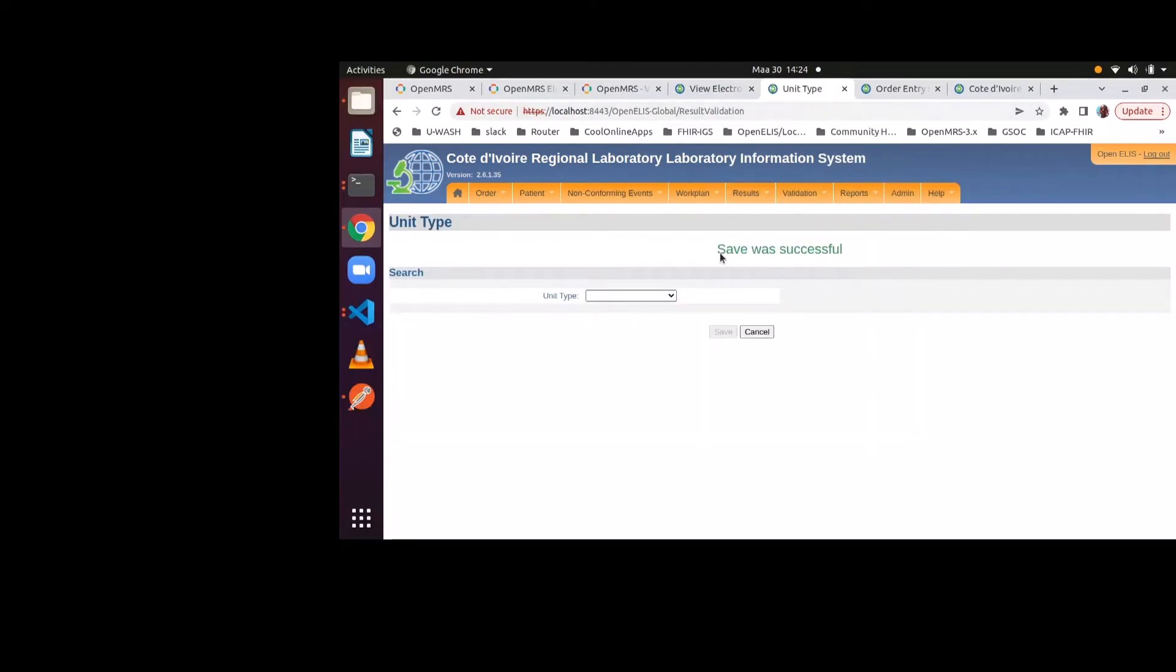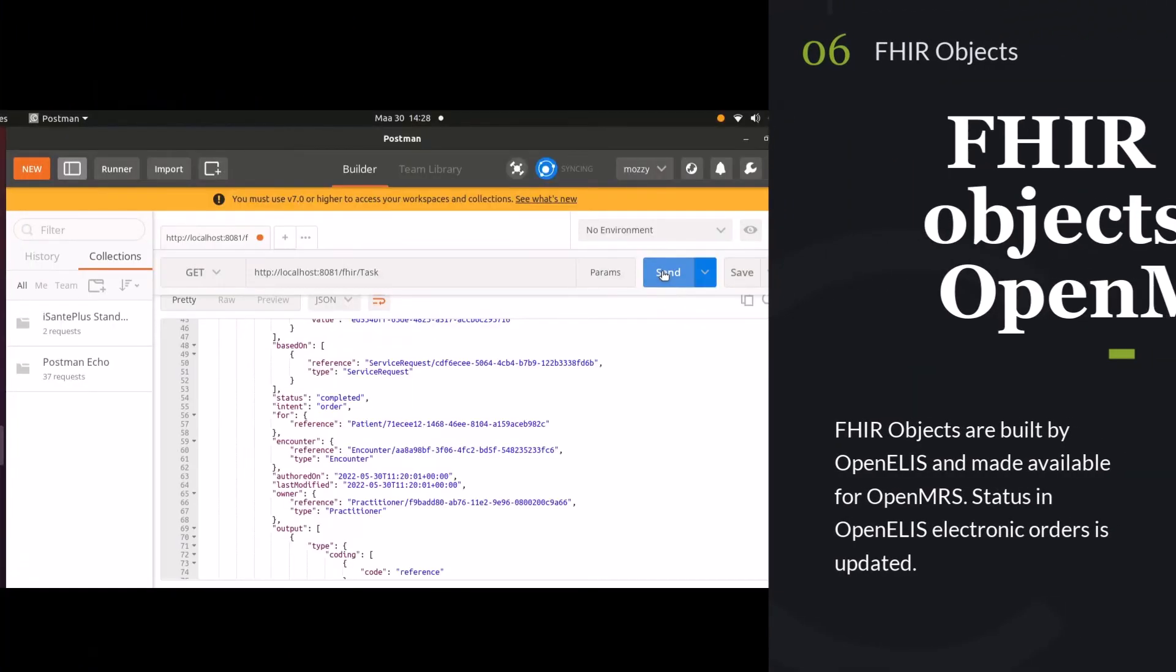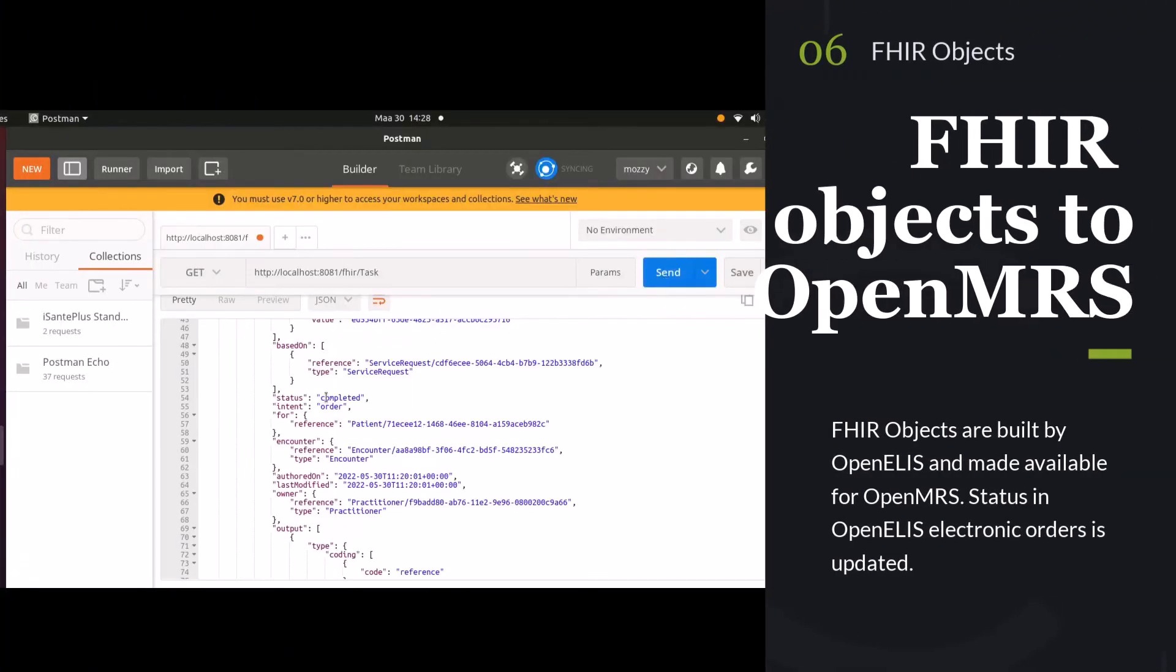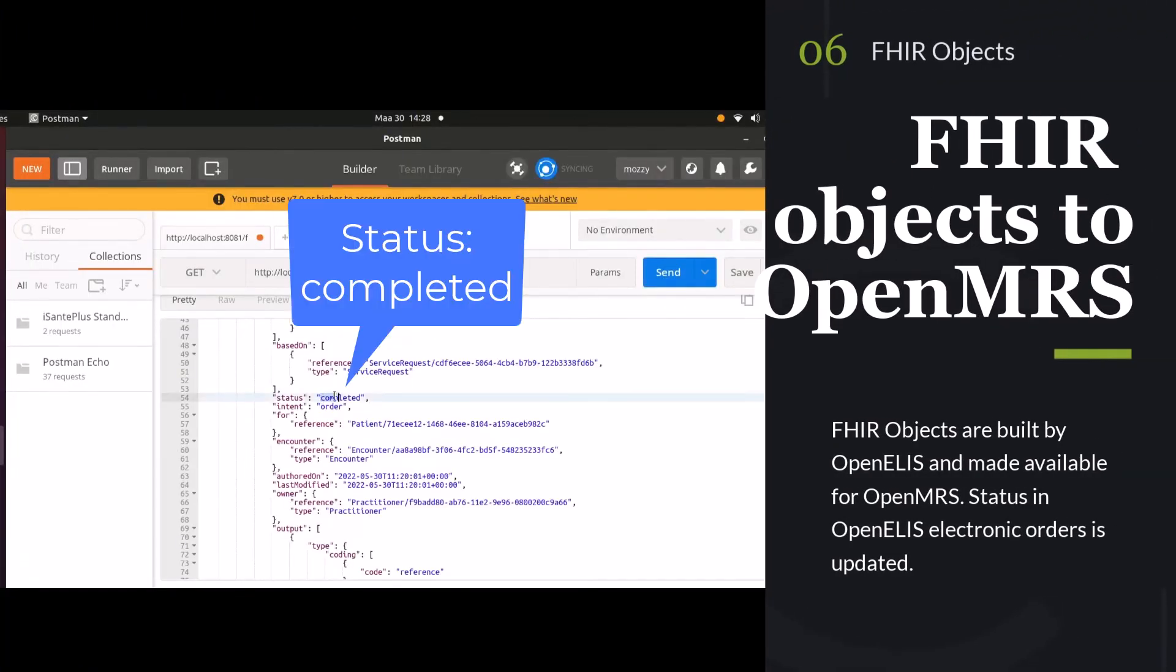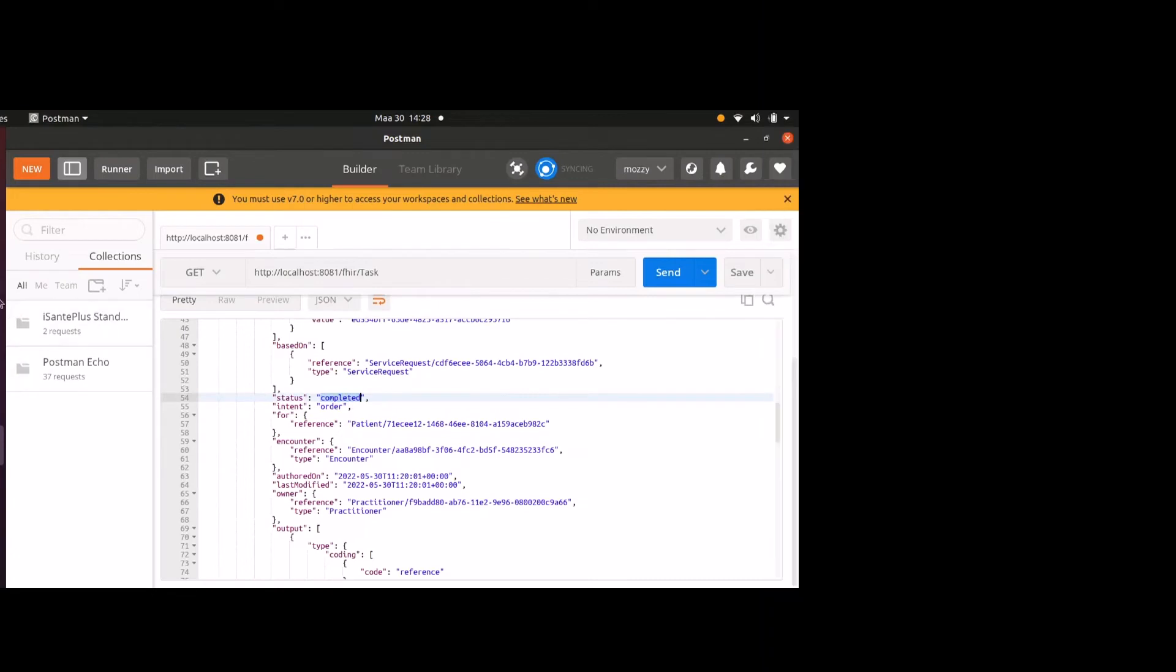So now that that's been saved, we'll see what happened to our task request in FHIR. Now you can see the status has been updated to completed status, and it is ready for OpenMRS to pick back up.